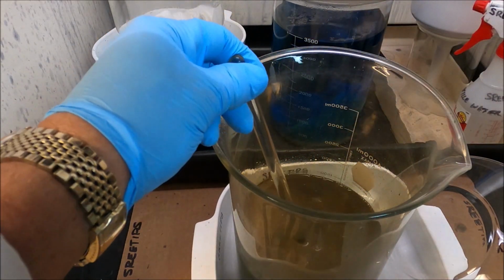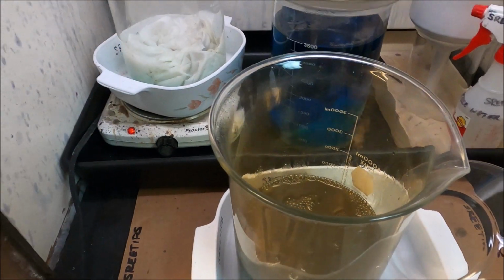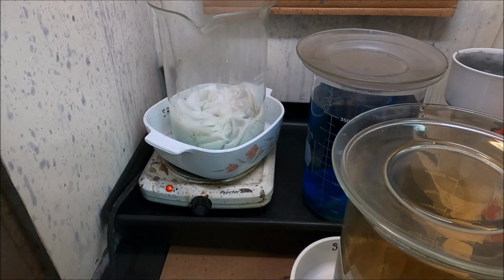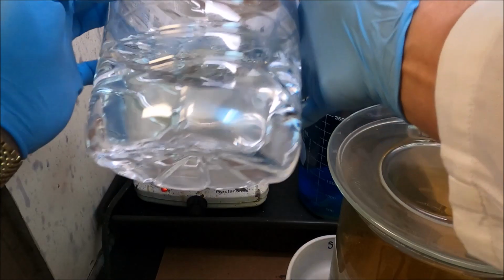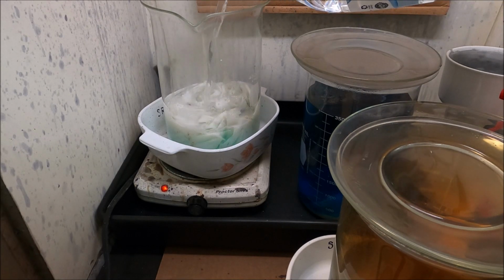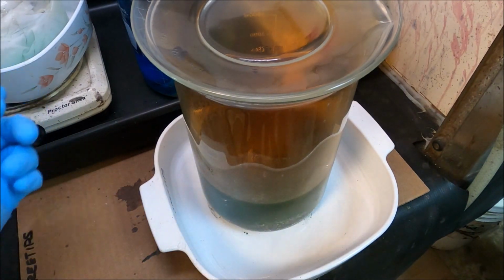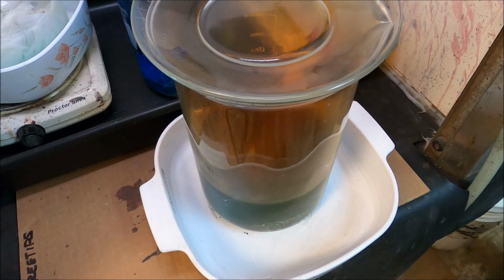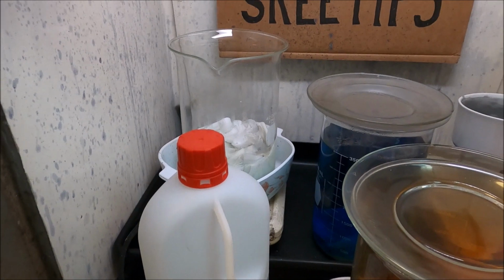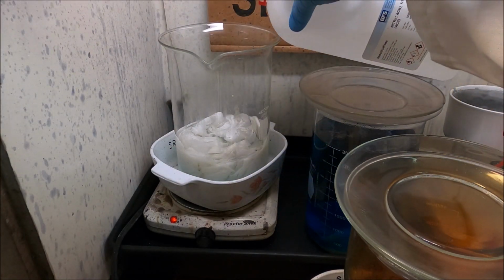And then what I'll do next is I'm going to replenish the solution back here in the back. And I'm going to keep adding distilled water and nitric acid to this back here. And we'll just keep getting the silver out of these filters. And then I'll add the rinse water to this beaker and use that rinse water out of our beaker in the back on the heat to dissolve the silver and other metals that are in this beaker here. And add some nitric acid to this back here now. About 200 milliliters or so.